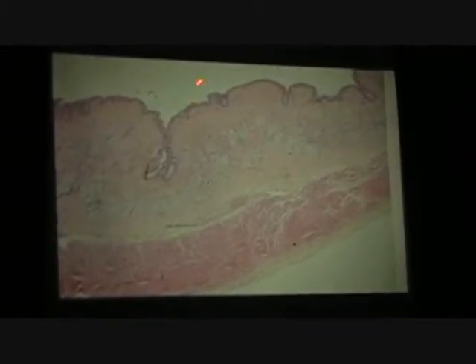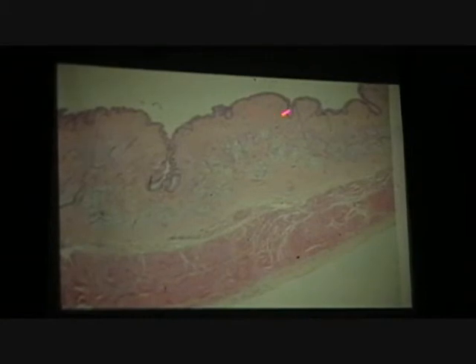Then you have to be able to identify the compartment of esophagus. And the way you do that is to see this first layer, which I will always have far more magnified, 200 times, so you could really see it as this purple zone. Purple, and sometimes it's more reddish. But it's just a multicellular layering up here, stratified squamous. And once you see that, it's got to be esophagus.